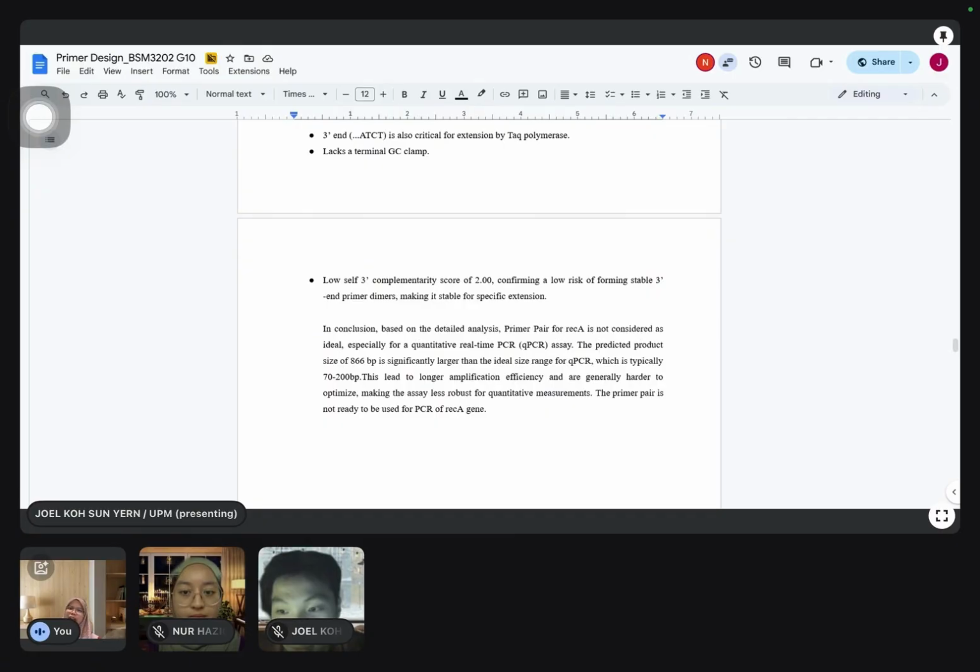So I'm just showing the non-acceptable kind of primer, unlike my other two group mates. Okay, thank you.